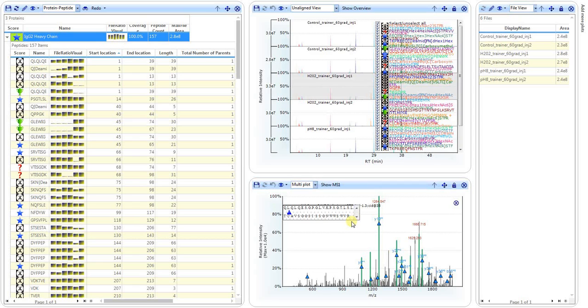Viewing of the data in the Pinnacle workbook is customizable, so we can show or hide all of the information or various aspects of the information that's created from the data processing. And the user has the option of rearranging this or hiding or displaying certain aspects of the information prior to the report generation, or you can create a report covering all aspects of the data processing. In order to set the data, there are some key options that are available.